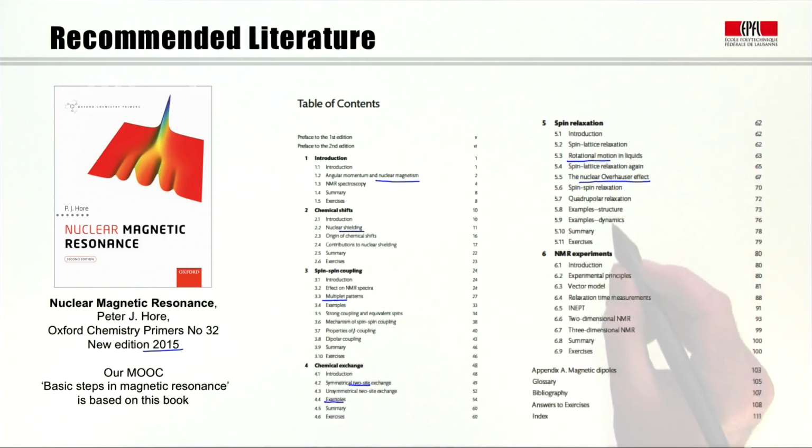But there are many other examples of relaxation studies that allow you either to determine structures or to characterize internal dynamics of molecules. And the final chapter is about NMR experiments. Actually, this is closest to my own specialty.